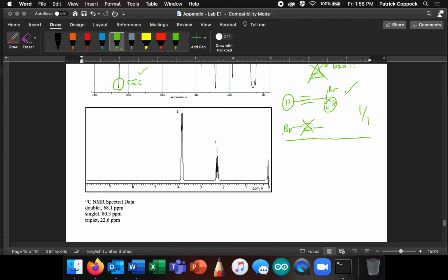Maybe no, I'm going to go look at my IR spectrum now because I'm going to forget to come back to that, because I'm not sure that there's any. I'm going to chapter 14. These are IR tables that you have for your exams, right? You don't memorize these. I'm looking on page 619 of the David Klein text, the 3rd edition, and I'm looking for a triple bond.